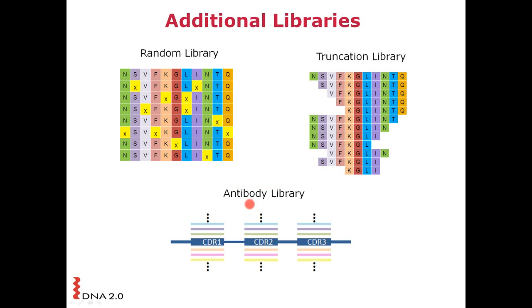This is a type of site scanning library where the diversity is focused on the CDRs of a particular antibody. And so, instead of individual mutations that you're combining, you may have a series of 5 to 8 to 10 amino acids all in a row, all in the CDR combining regions, that you're going to diversify in a specified pattern.